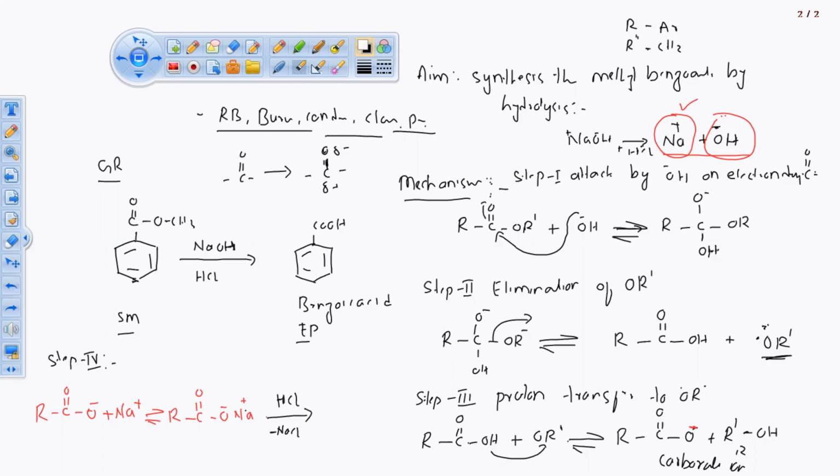solidified. The chloride and sodium have gone, what is left? The proton. It definitely needs the proton, it definitely needs the H. At the end it required the proton, because of that we are carrying out all these things. So H will get added up to this one. In this fashion, we are going to get the benzoic acid, the pure form of benzoic acid crystal.